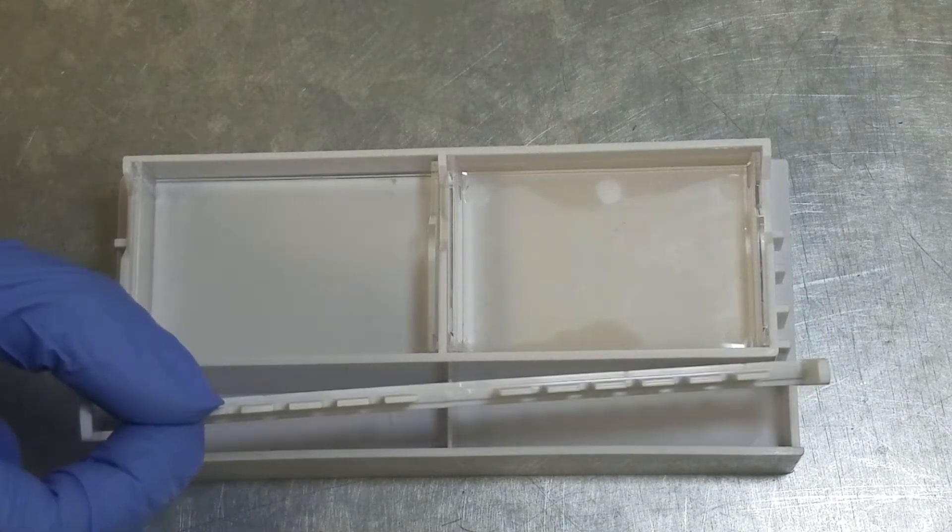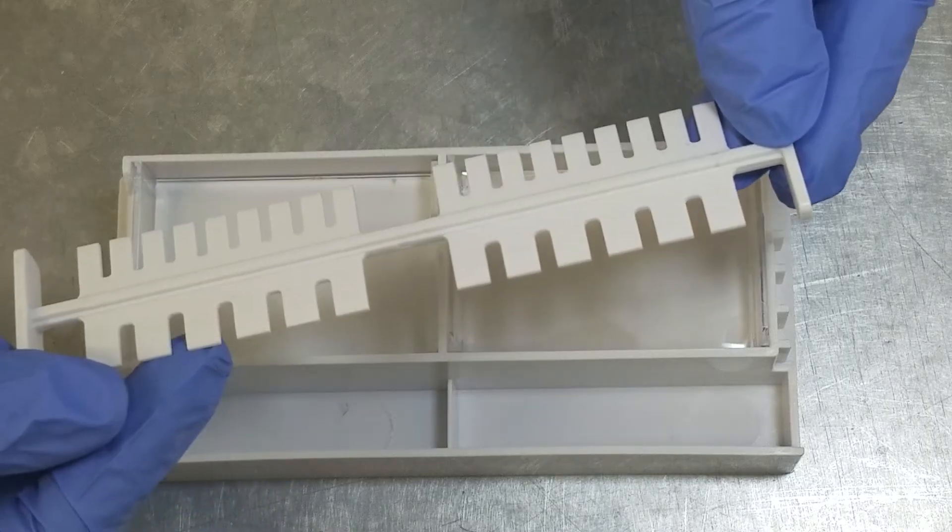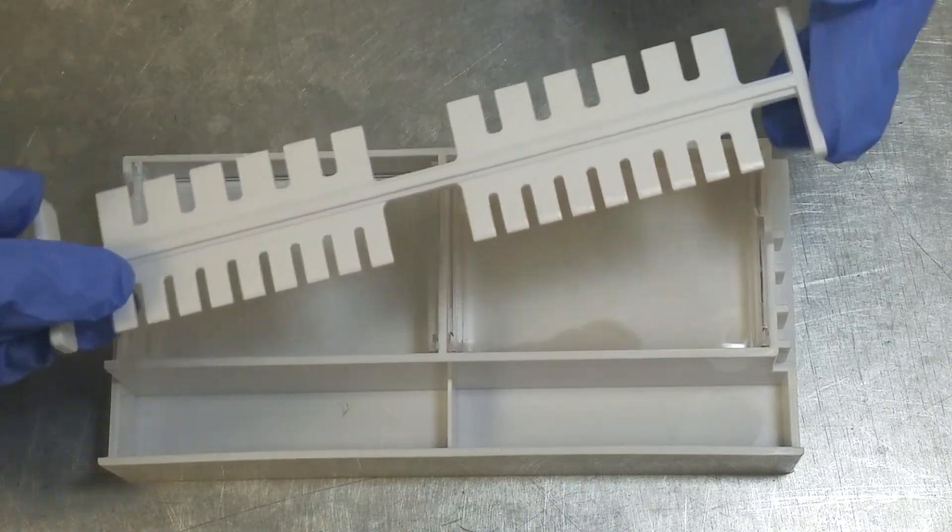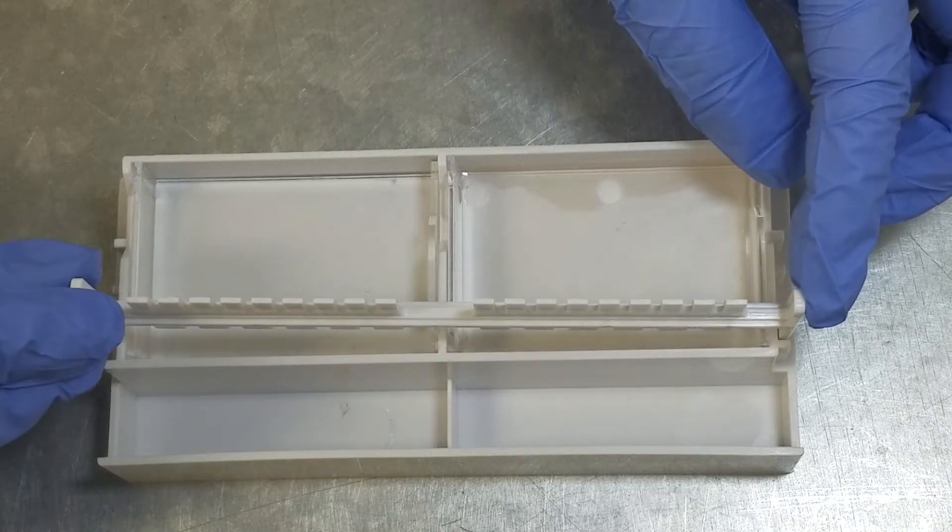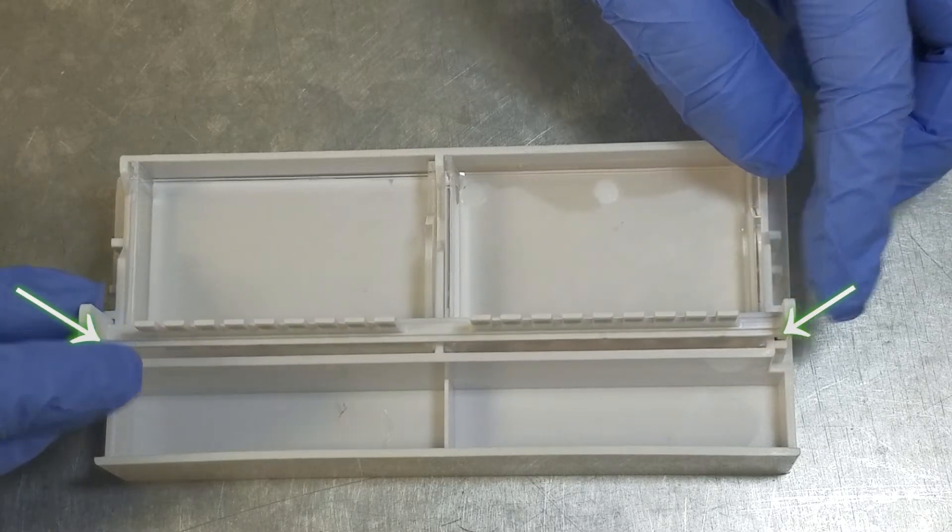Put the comb into the casting stand. You can choose to make a gel with either 6 larger wells or 9 smaller ones. If you are running DNA samples, put the gel comb into the furthest slot of the casting stand.